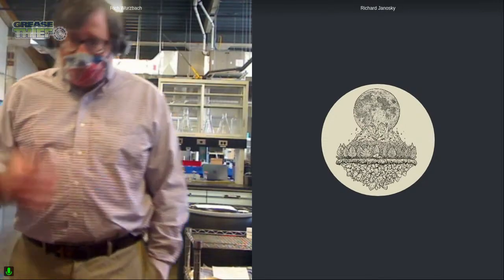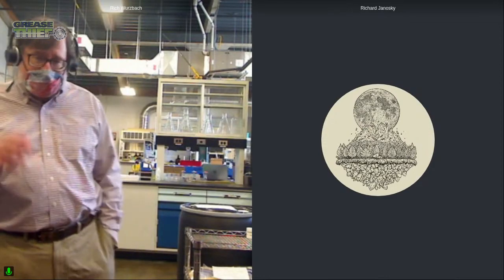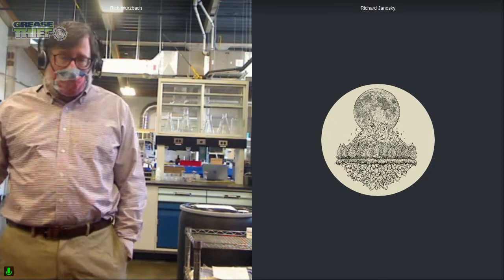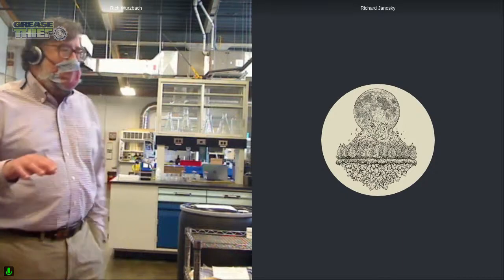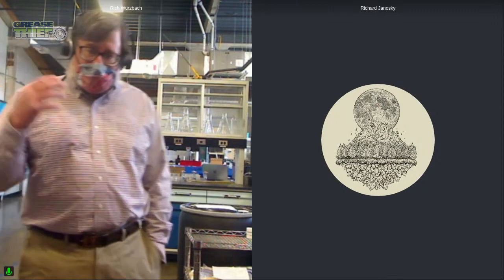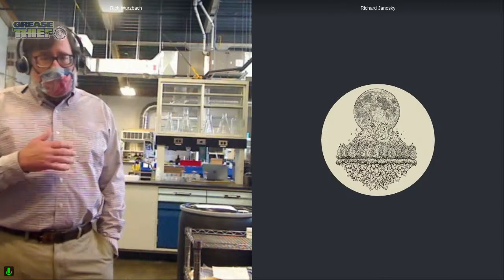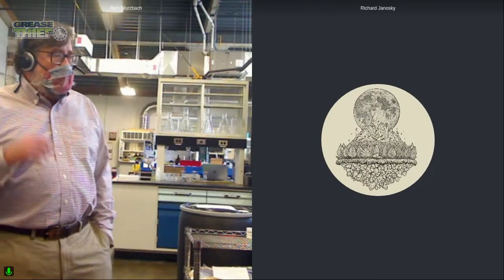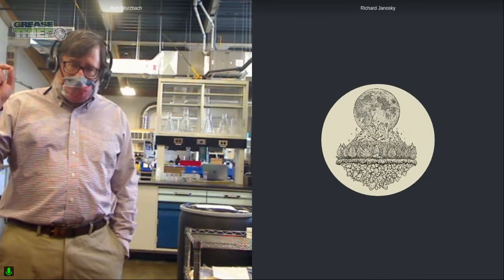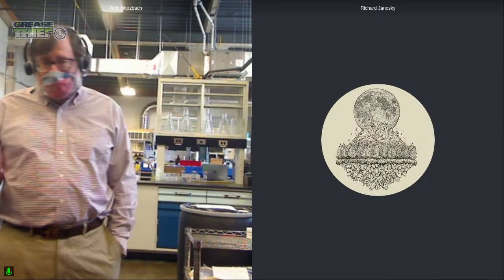What we found in that case was this grease. Realize that there are a finite number of companies that actually make and formulate grease. There are additional companies that sell grease, so sometimes you get relabeling going on. This was a grease that had a label identifying the product, and it was from a company that didn't actually make grease. Somewhere along the line, they changed suppliers. So the same named product had gone from having a very strong antioxidant response to a new formulation that had no antioxidant response. So there was no way to compare them.